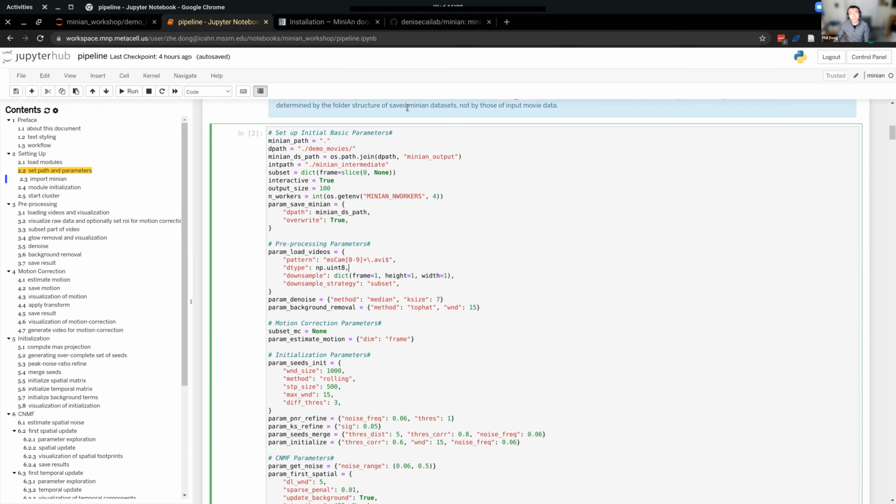I think the plan is that for whoever uploaded data with MetaCell, you can go ahead and run them. And everyone here will stick around to answer any sort of question that arises. I'll try to do my best to answer, but if you have a more specific question, like a specific error, we might have a TA assist you in a breakout room.